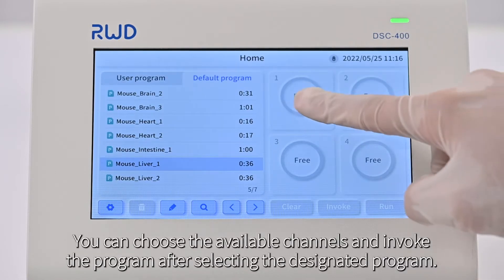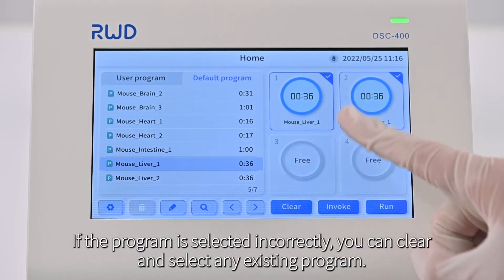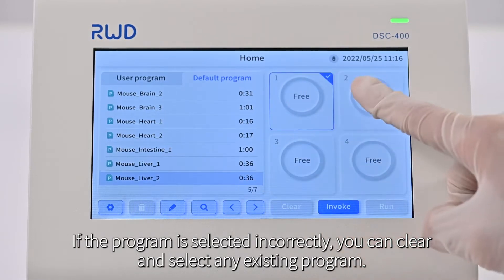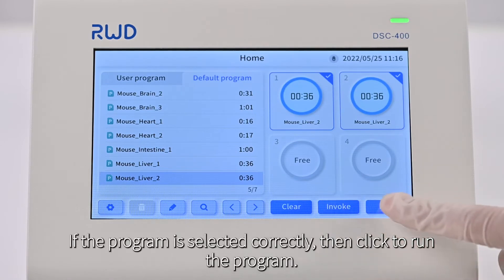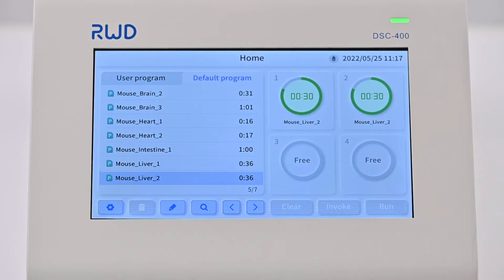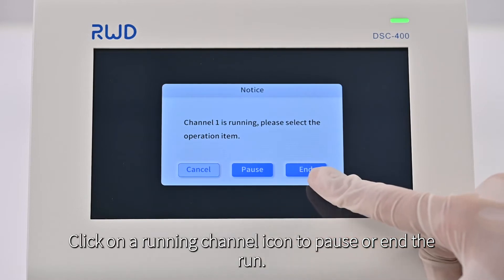You can choose the available channels and invoke the program after selecting the designated program. If the program is selected incorrectly, you can clear it and select any existing program. If the program is selected correctly, click to run the program. Click on a running channel icon to pause or end the run.